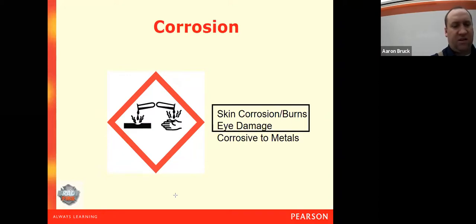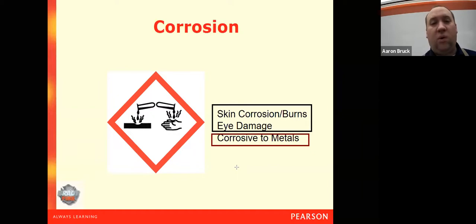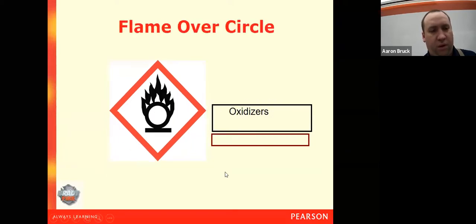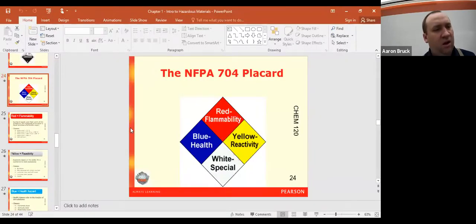We have health hazards in terms of damage to skin and eyes, but we also have damage to non-health with the ability to corrode materials. And so this is the only one that has that crossover ability, where it'll actually impede on both. And so that is it for the NFPA placard system and the GHS system.